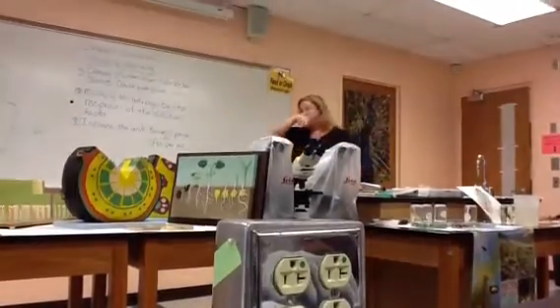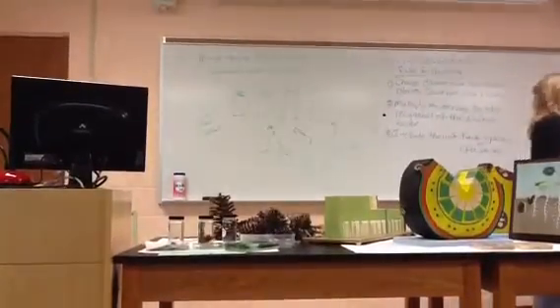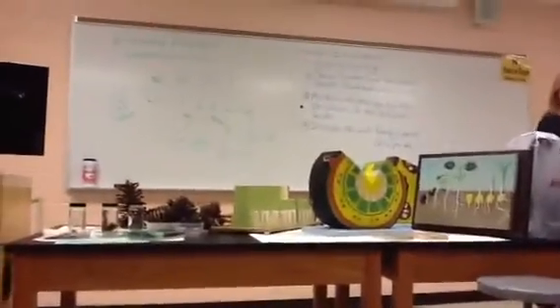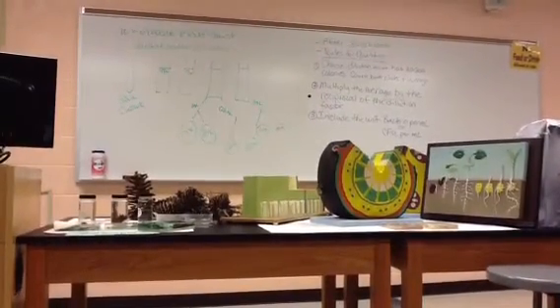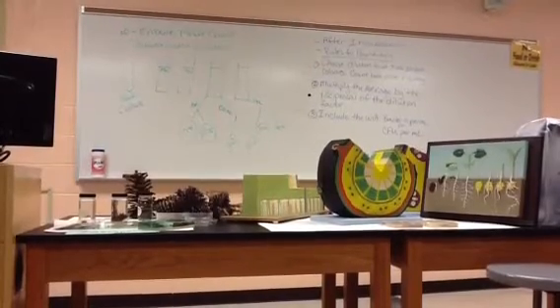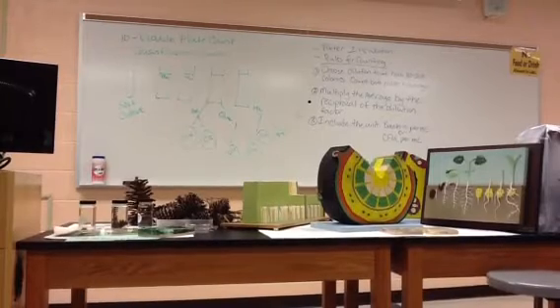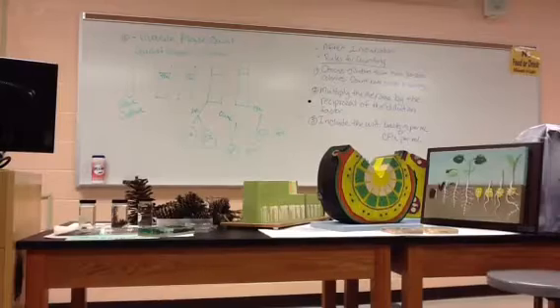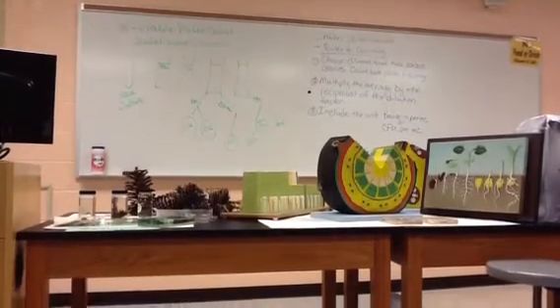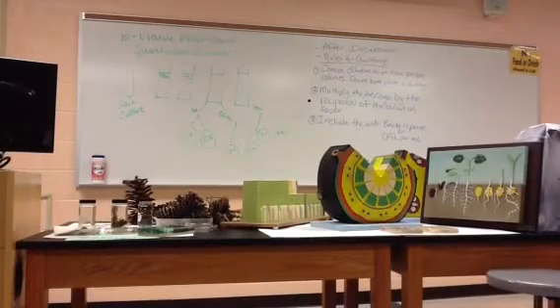So, Lab 10, this procedure is called a viable plate count. Viable because we're only going to be concerned with the bacteria that are alive, right? That's viable. They're living and able to grow. Plate count, right? Plate means Petri dish. And count, we want to know exactly how many bacteria, or as close as we can get to exactly, are in a stock culture. That's the purpose of a viable plate count, to get an actual count of the number of bacteria that are alive and able to grow in the stock culture.